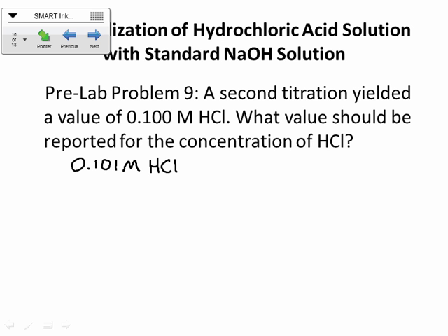I will say what that means tomorrow is you're going to have to move fairly quickly because you've got to do 4 titrations, basically. Okay? We'll see if we get there. If we don't, I think that the Tums and Rolaids will go a little bit faster, but we'll just see how far we get tomorrow. It says also prepare a data sheet for the NaOH standardization, so it would be good to have an idea of how you're going to collect your data, and it tells you what things to put in that data table. All right?